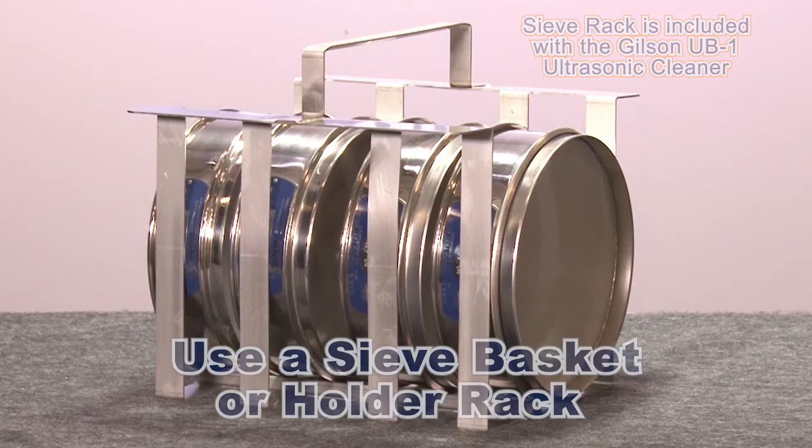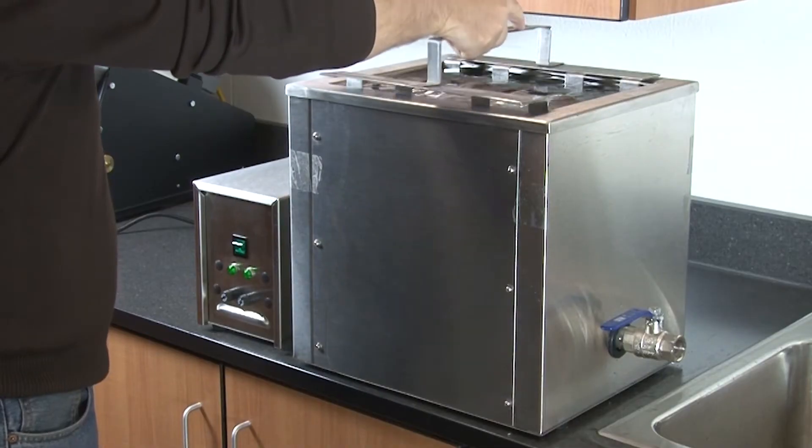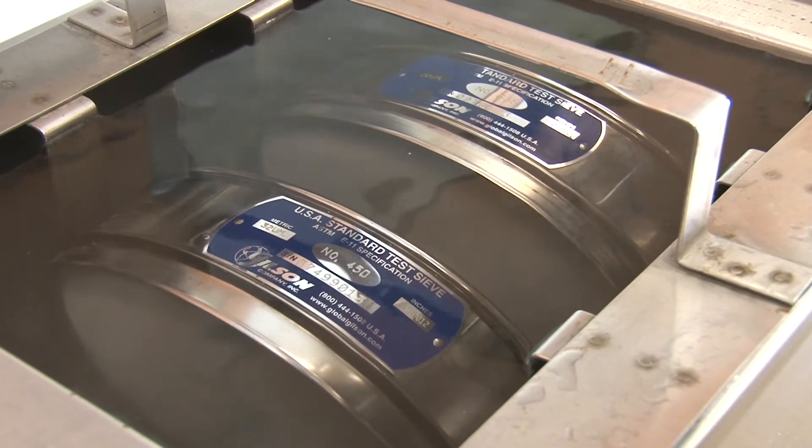A sieve basket or holder rack must always be used when cleaning test sieves. Do not allow the sieves to rest on the bottom of the cleaning tank. Not using a basket may damage your test sieves and also greatly reduce the ultrasonic cleaning action.